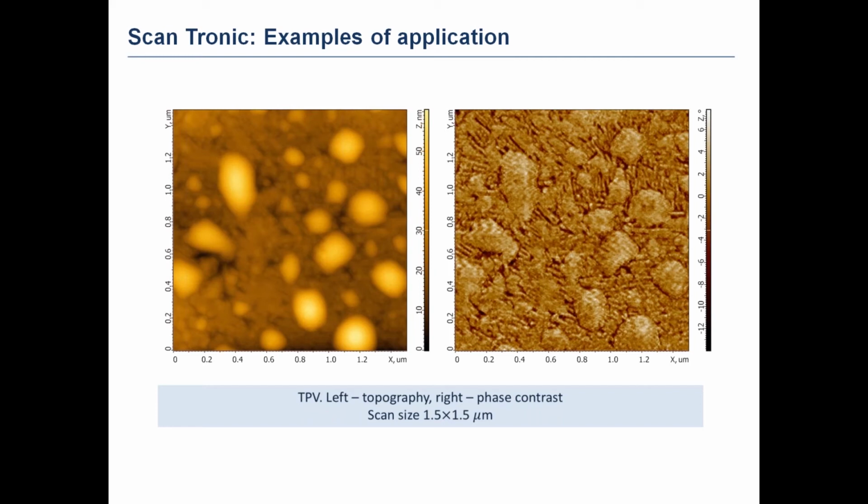But the variety of samples is at the same time a problem here, because the sample can have very rough topography, or in contrast can be almost atomically flat. The sample can be quite soft or quite hard.